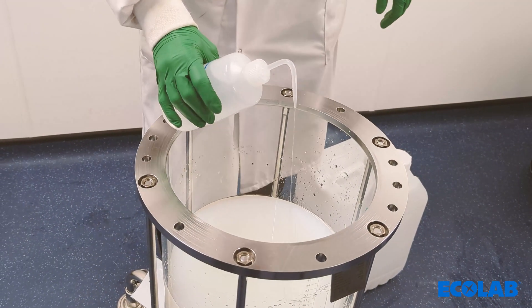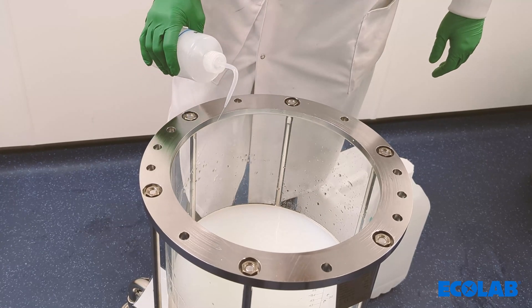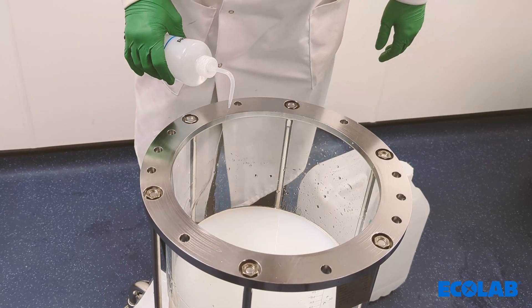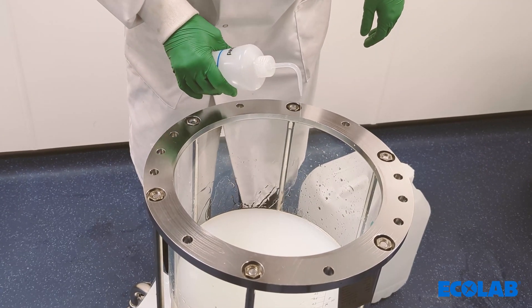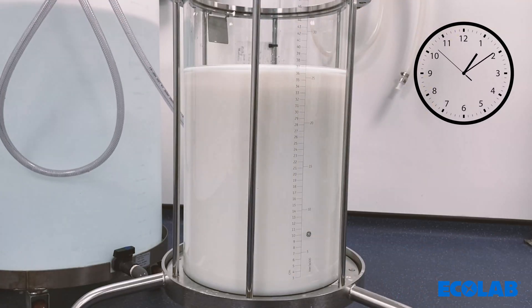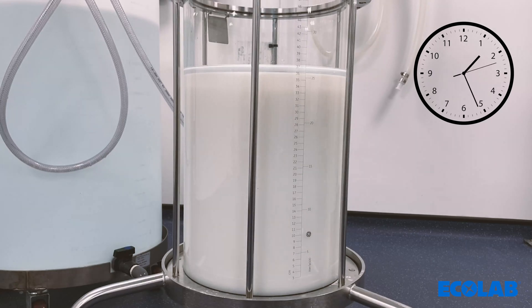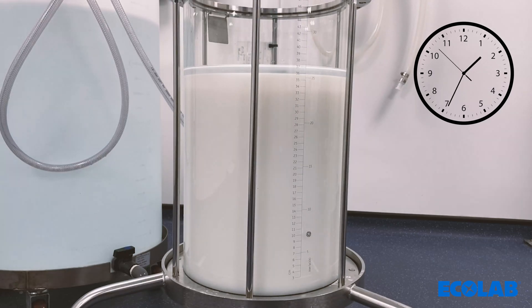Best practice is to clean the sides of the column of any residual resin; this can be done using the packing buffer. The resin then needs to be allowed to settle up to five centimetres before the top adapter is added to the column. This avoids any resin being lost above the adapter.